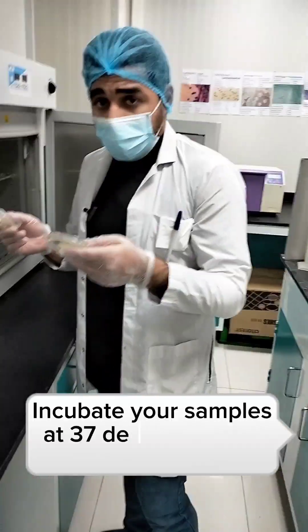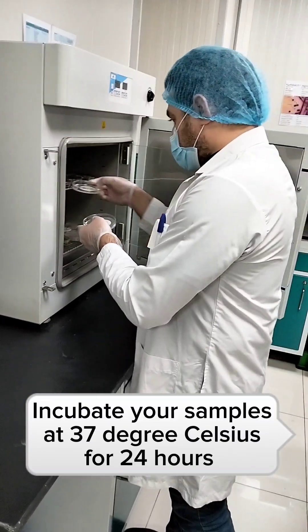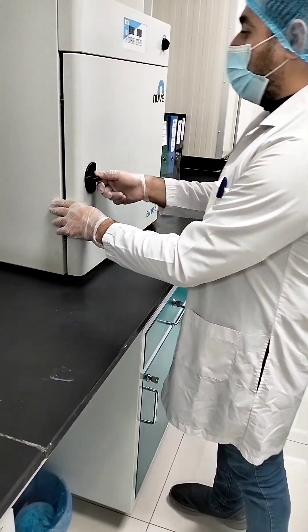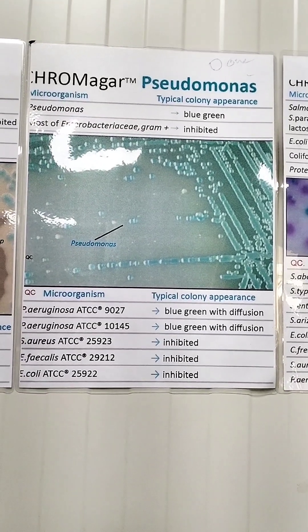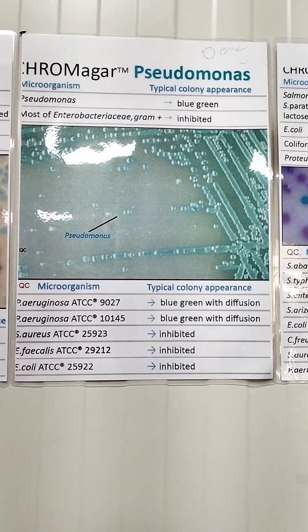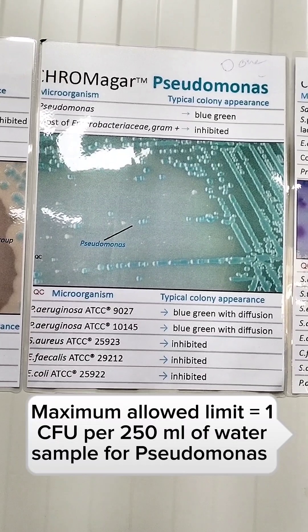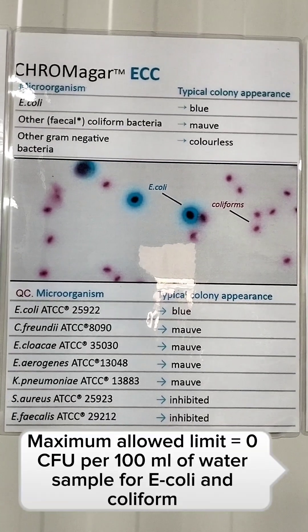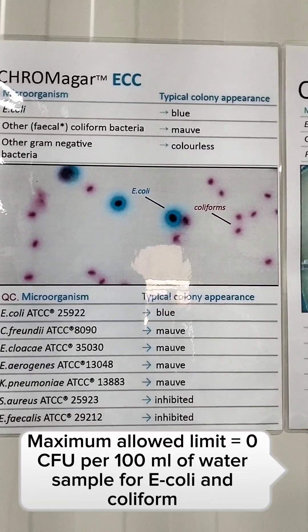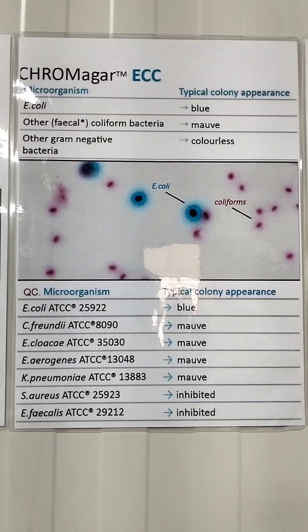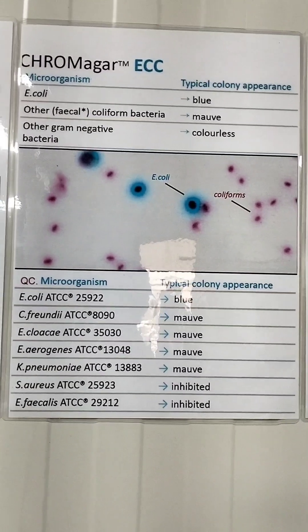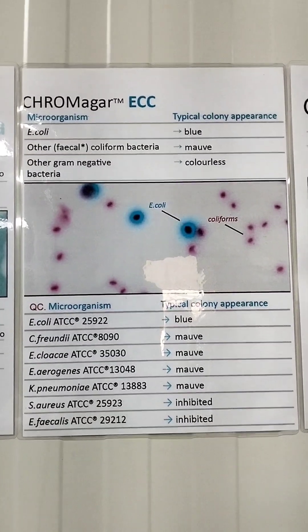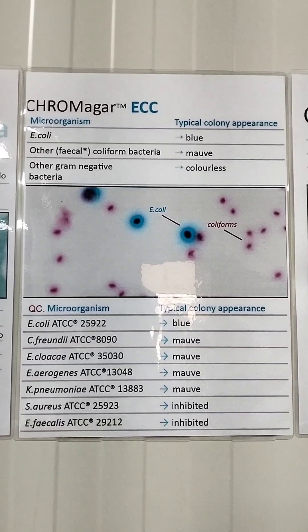I am going to place my samples in the incubator and check the results after 24 hours. If the water sample is contaminated with Pseudomonas, it will produce blue-green colonies with diffusion; the maximum allowed limit per the GSO standard is 1 CFU per 250 ml. For E. coli and coliform, coliform gives red colonies and E. coli gives blue colonies; the maximum allowed limit is zero — they should not be detected in 100 ml of water. If detected, it means your water is contaminated with deadly pathogens and should not be consumed.